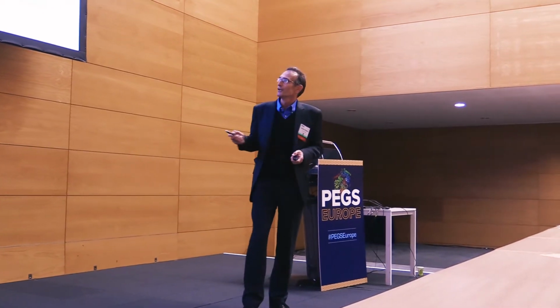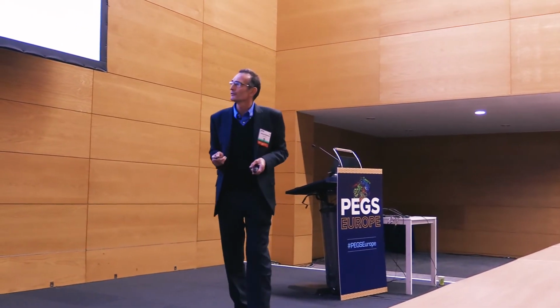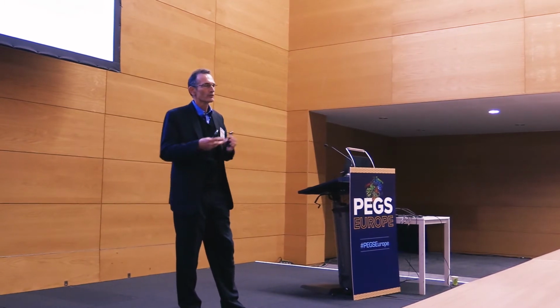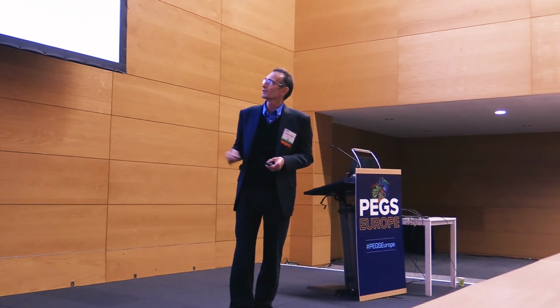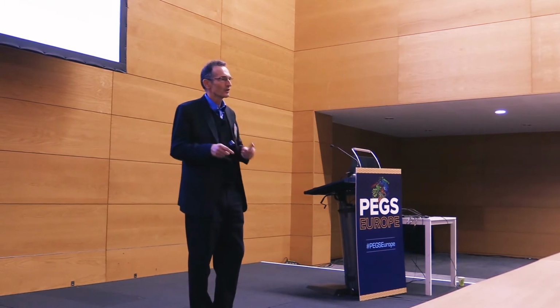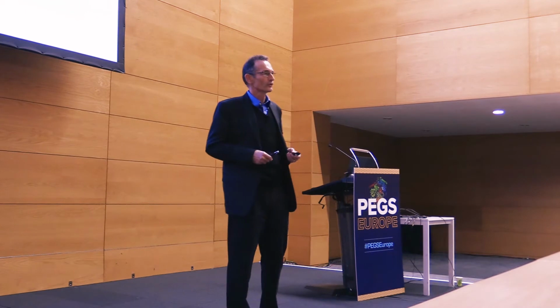And in addition, will allow for straightforward screening so that we can screen as many different antibodies as possible. You want to avoid screening the same antibody over and over again, which is what happens if you just pick clones and screen them. You want to have a broad paratopic and sequence diversity. It's clear the greater the diversity of the antibodies that you'll be able to screen, the more likely you will be to hit an epitope of interest. And then finally, we argue that you want an exclusive library.